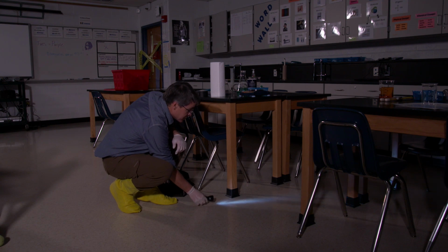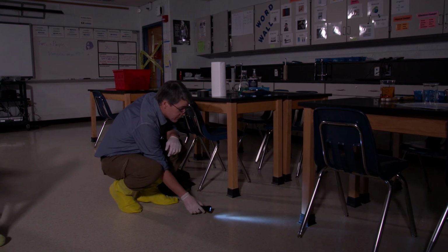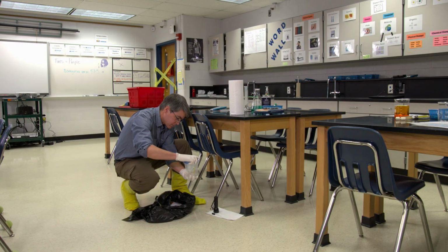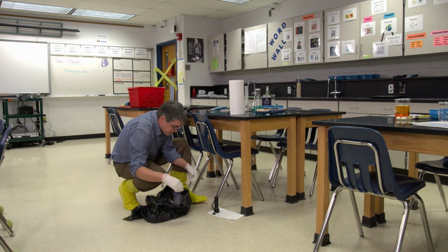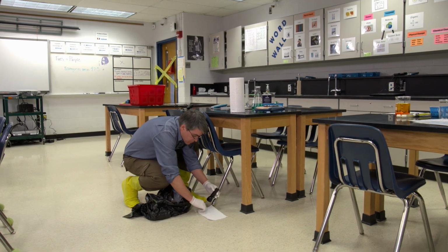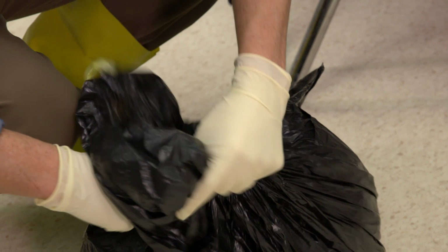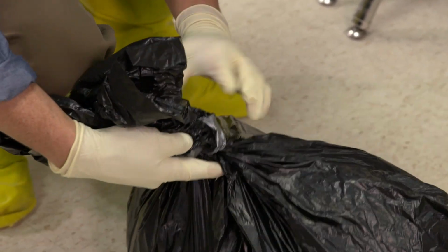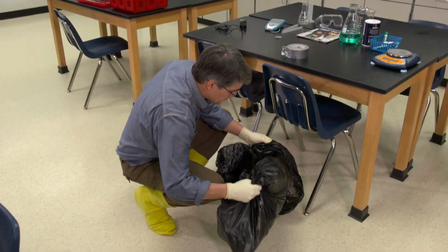Store the mercury that you have cleaned up from the spill area properly so it doesn't escape and recontaminate the spill area, or contaminate other areas at school. Place all zipper-top bags and screw-top plastic containers that contain mercury-contaminated items, and all cleanup materials and tools into one or more large trash bags. Place these trash bags with the trash bag or bags you filled earlier containing contaminated items. If anyone is still wearing clothes or shoes that might have mercury on them, they should take them off and put them in a trash bag.